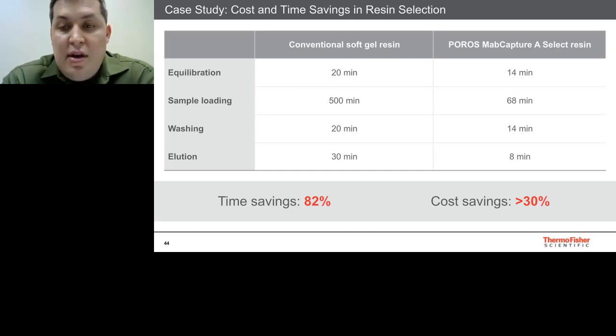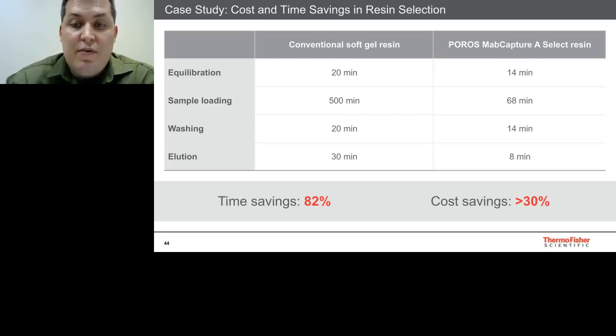Using the faster time, they did not notice a difference in the activity, yield, or purity from their overall small screen testing. So they are able to achieve the same product and reduce processing time by fivefold. This was a huge advantage to them, and they were able to significantly increase throughput for their lab. Similar results could be seen on the bioprocess scale.